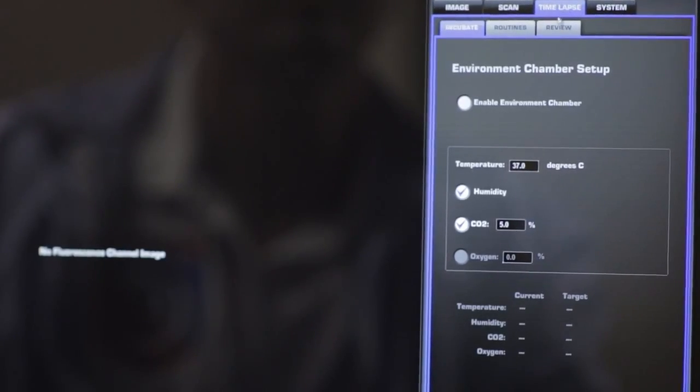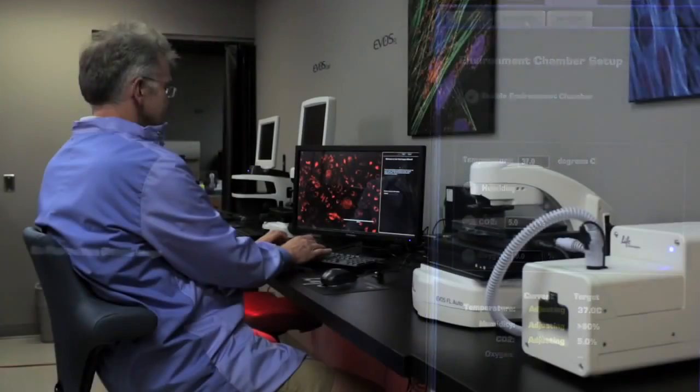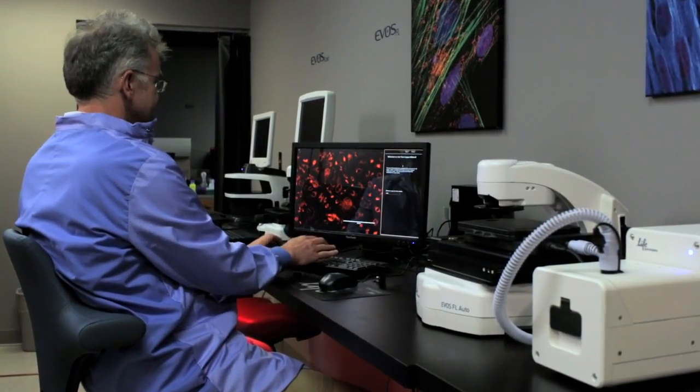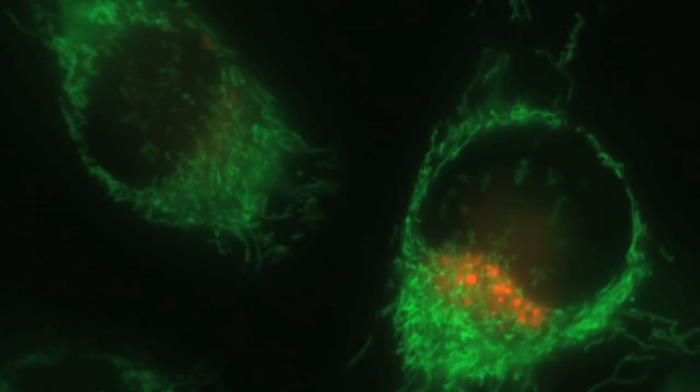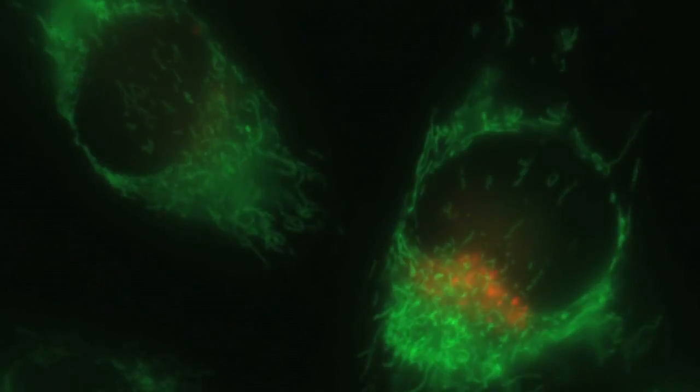Environmental settings and image acquisition parameters are all seamlessly integrated into the EVOS FL Auto System interface, creating a high-performance inverted imaging system with flexibility, ease of use, and superb optical performance for demanding live cell time-lapse imaging experiments.